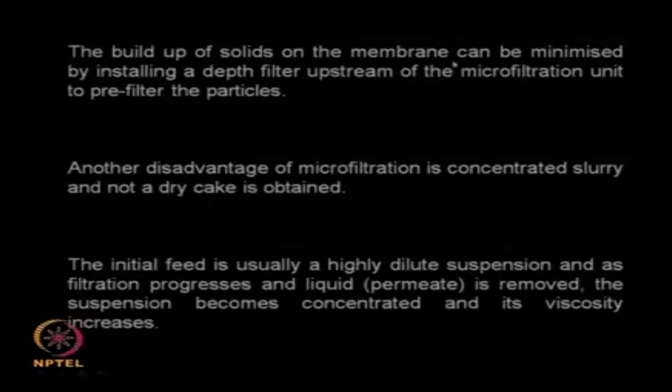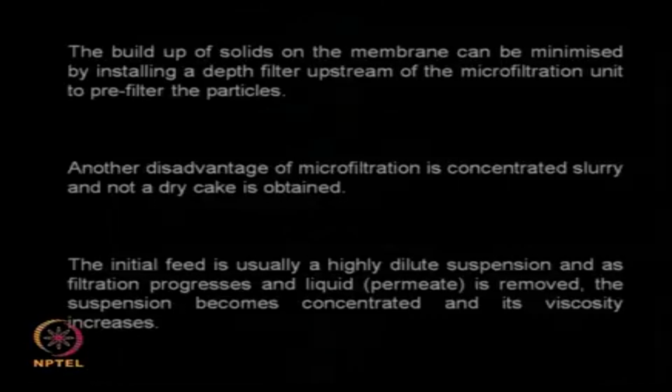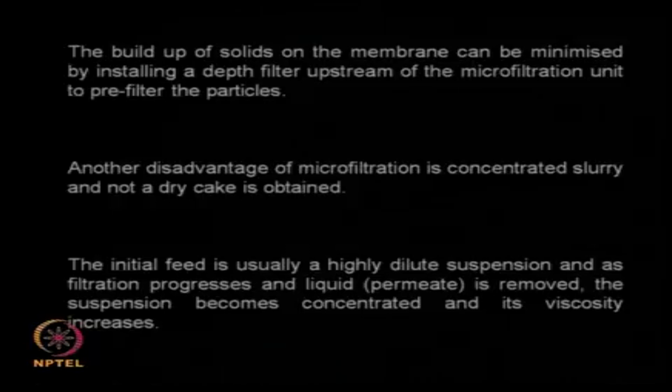So the buildup of solids on the membrane can be minimized by installing a depth filter upstream. So we can have a pre-filter or a depth filter. I talked about depth filter also before. So that depth filter will remove a large quantity of your suspended solids, and then we can go to a membrane. So the buildup of cake in the membrane will be much less.